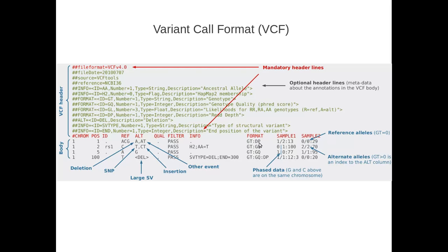And so for a variety of reasons, people just tend to work with the variant sites, although as you'll see in the GATK, when you do the SNP calling, you can also call invariant sites. So you do have that option. The file obviously gets very large when you include both variant and invariant sites. So this is a variant-only VCF.